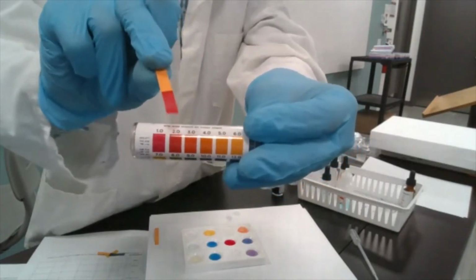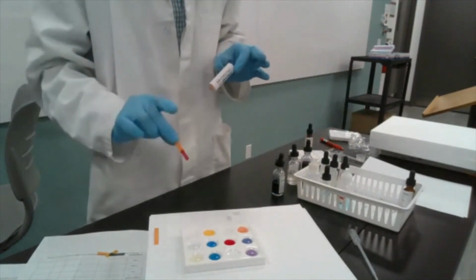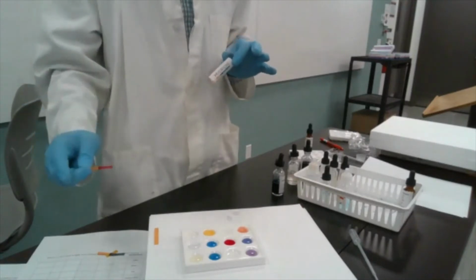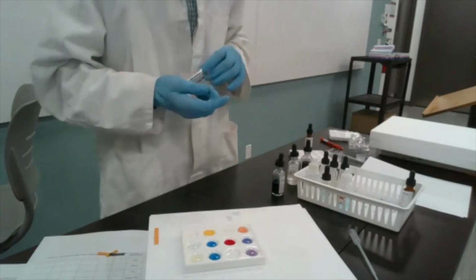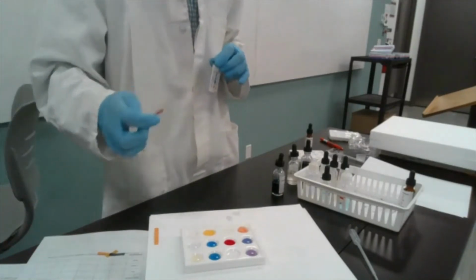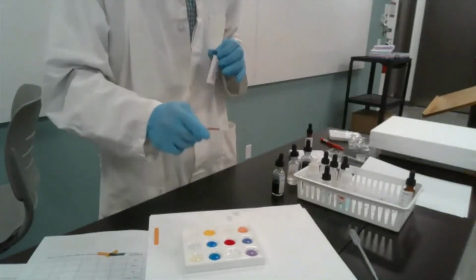So this is hydrochloric acid universal indicator. We have tested our first 3 substances, and one of them was water, which is pH 7. You saw how the indicators responded. And then we tested a known base, sodium hydroxide, and a known acid, hydrochloric acid. And we saw the color change.